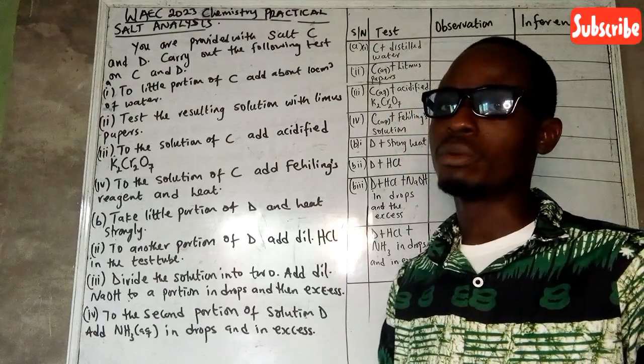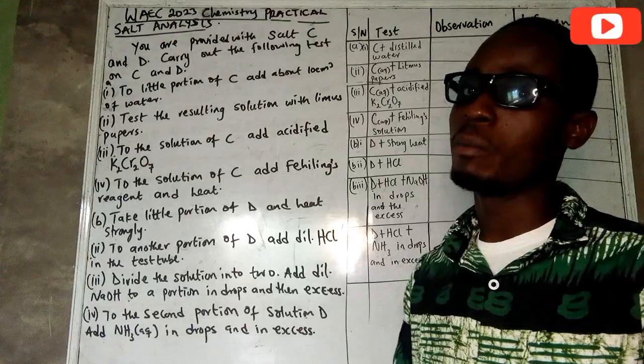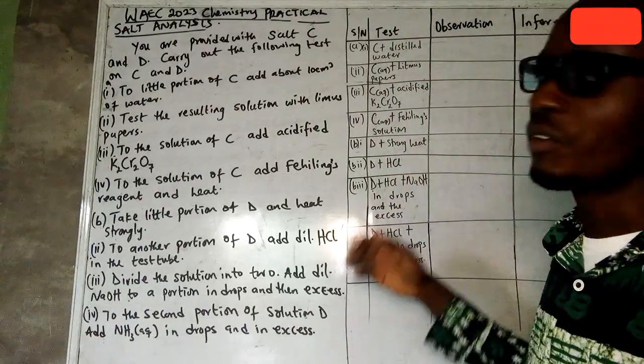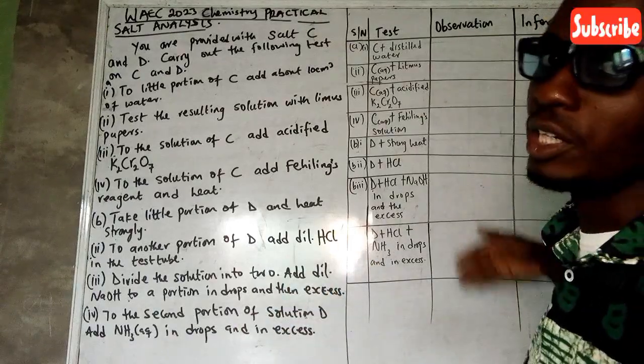We are going to show you the practical view of everything, but let us go through the question and see what we are meant to do. I've written out the text in this table. So whatever the observation and inference we get from this practical, we're going to fill in the gaps here.